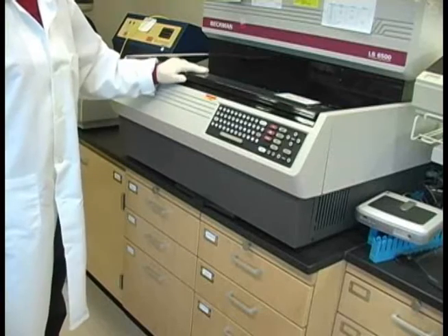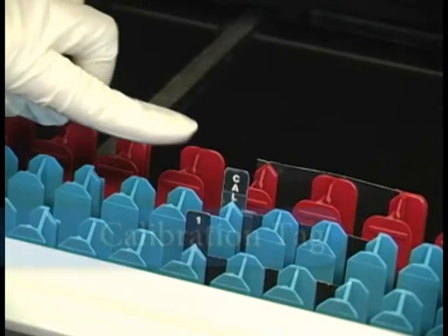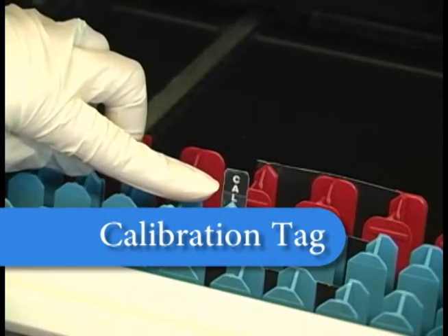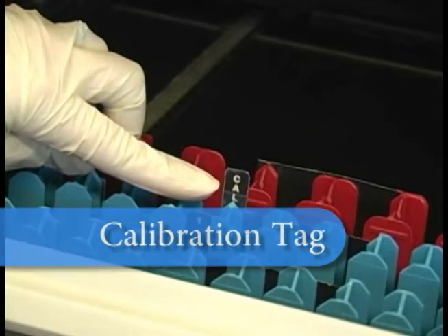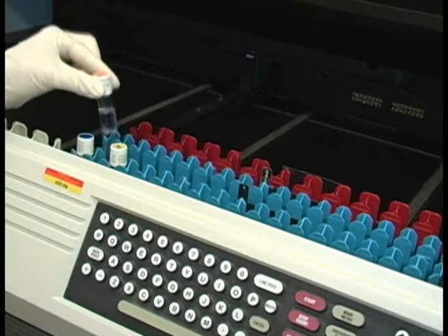To calibrate the LSC, you need to find the calibration tag and then place a carbon-14 source into the calibration rack.